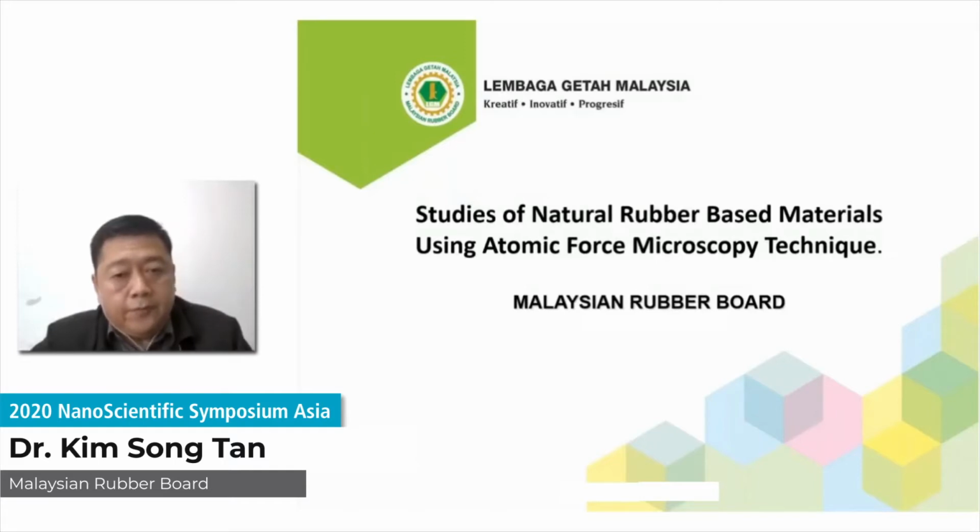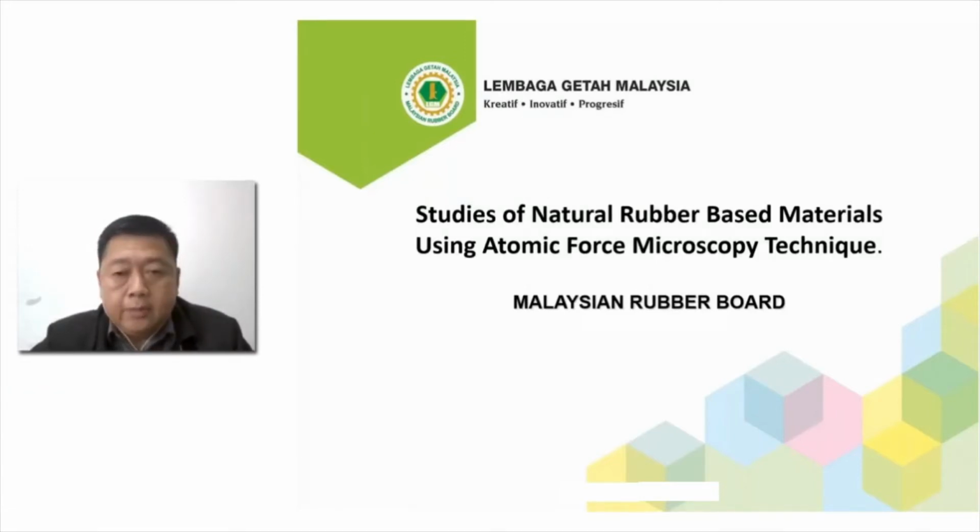I'm working with the Malaysian Rubber Board, which is a government agency of Malaysia. And we bought the AFM machine a couple years ago, and since then, we use it a lot in our R&D activities. So today, I'm going to present part of the R&D findings using the AFM as a main tool.